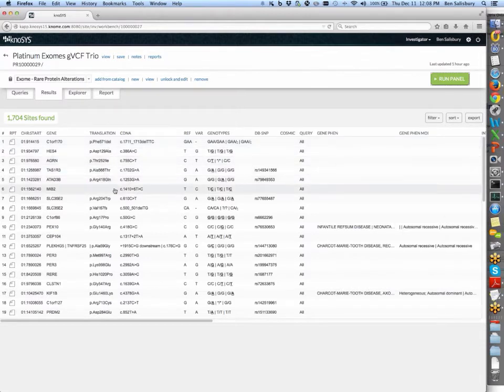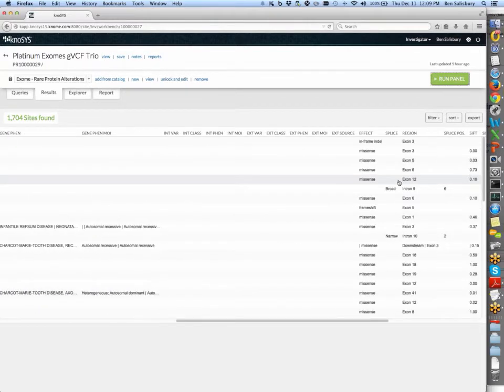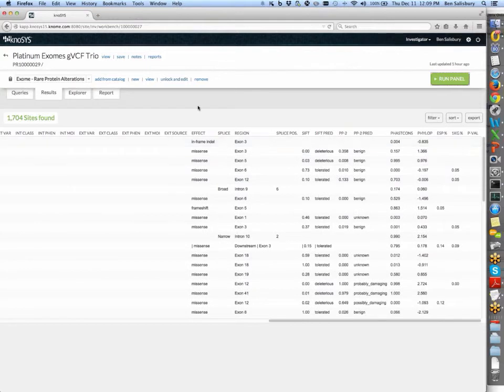Most of these are missense, some splice, potential splice alterations, and we have the genotypes. And many of these genes have been associated with various diseases. Many of them have records at dbSNP. Very few have a record at COSMIC, which makes sense given this is a germline sample. Looking over here to the right, we can see the predicted protein effects of mostly missense, some indels, some broad or narrow splice defining variants.